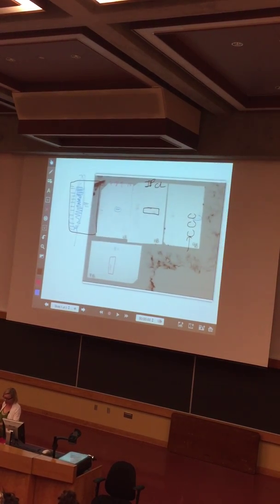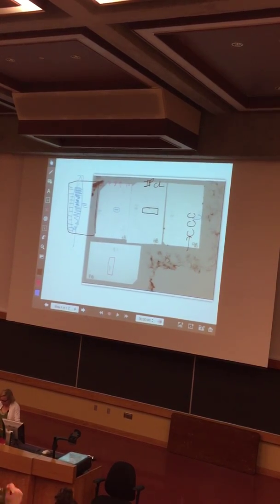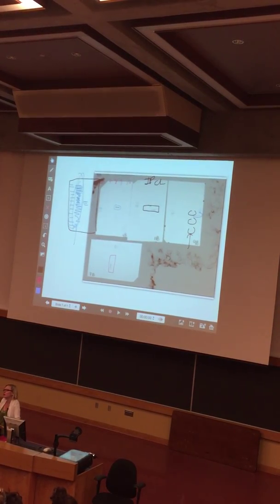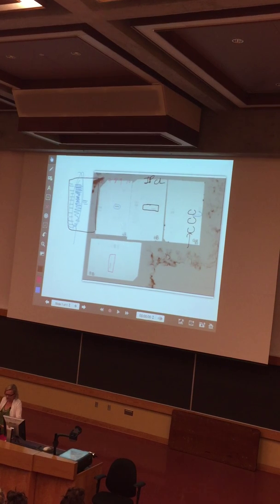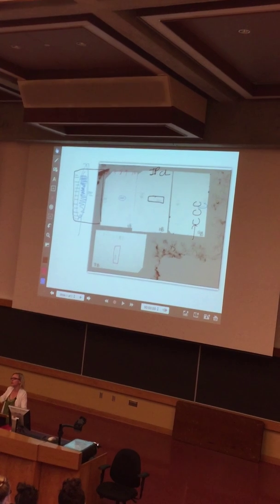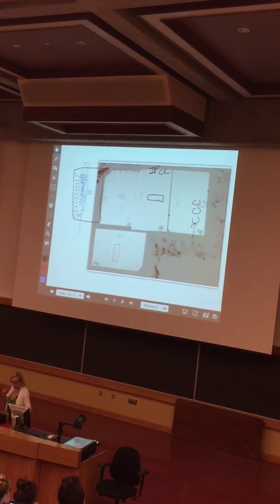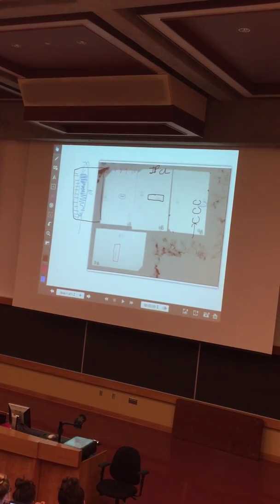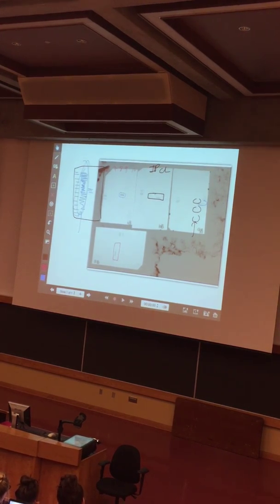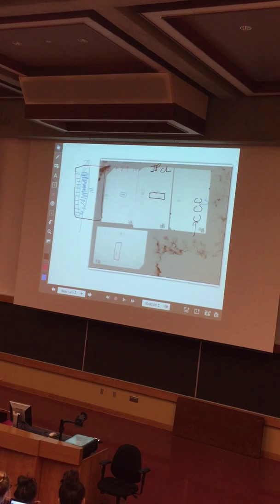In your lab report, I think it would be very good if you presented the figure of your Coomassie gel, post-transfer gel, and then your membrane side by side. Okay, so in figure 1, for example, you can have 3 panels, A, B, and C, and then you can talk collectively. You can do a collective legend, and then you can talk about all of the results, because it's one experiment, even though it was over several weeks, right?